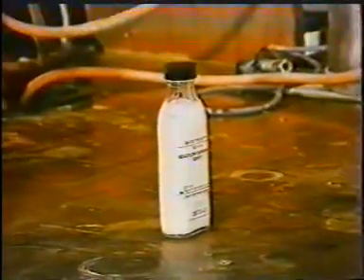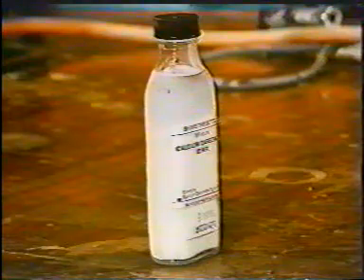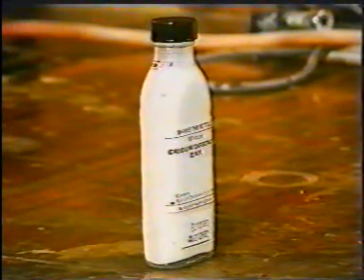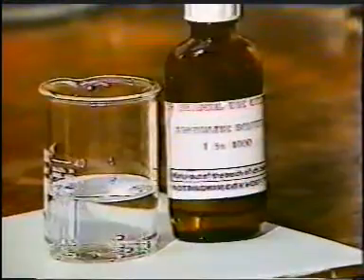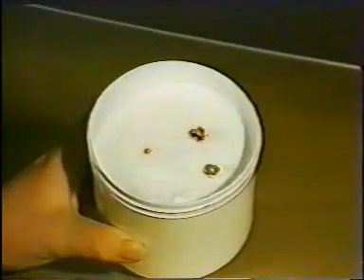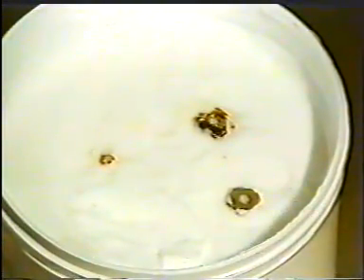Let us now consider the steps leading to a satisfactory product from the point of view of the quality controller, beginning with the important stage of formulation. Remain suspended whilst the dose is withdrawn. Here is a much better preparation. This product is subject to oxidation. This formulation has had an antioxidant added to it. Here is a product which does not contain an adequate antimicrobial preservative system and has become contaminated during use.